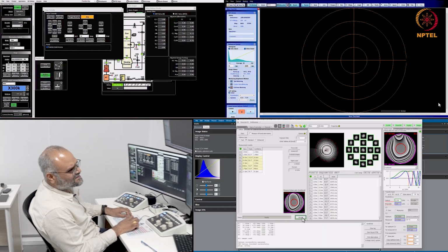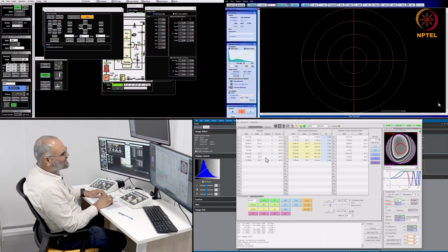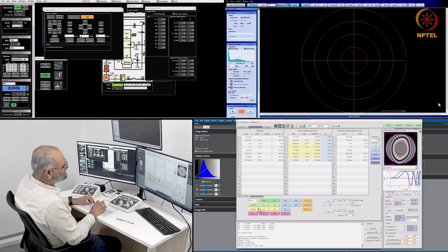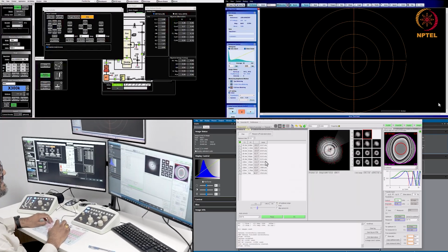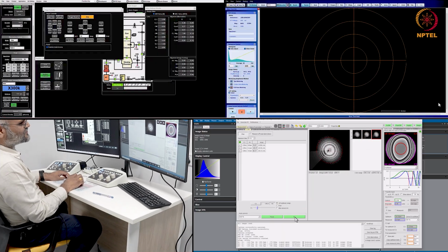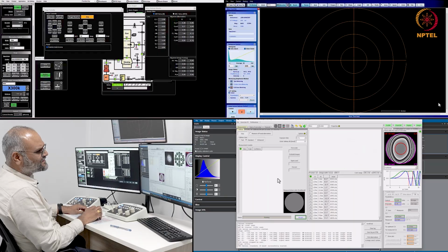And with the higher tilt angle, let me now correct for the lower order astigmatism first, which is A2, B2. And then let me check for twofold astigmatism again. The twofold astigmatism has not changed much, and I'll start tableau again.